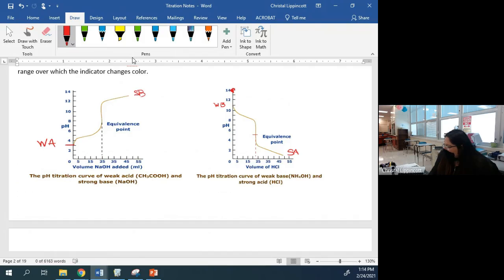The equivalence point is where, do you see this straight line that occurs here? That's your equivalence point, and you will find however many milliliters you have at that point. That is the volume of the HCl that it took to get this to come out. So if we knew the molarity of that HCl, we could tell how many milliliters we put in and be able to determine how many moles of hydrogen that is.